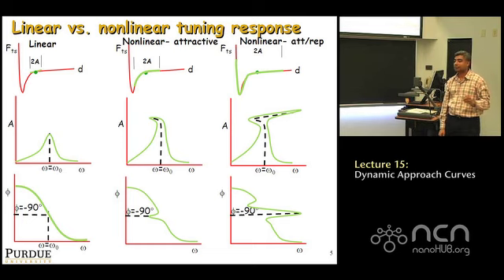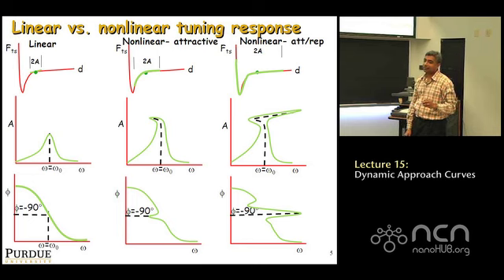Yes? Fair question to ask if anybody in the class has actually seen this behavior when they do the tuning curve. Has anybody actually seen this? Well, it's a good question, and you will see. Most tuning curves are done when you disengage from a surface. When you disengage from a surface, you're 2 microns away from a surface typically. So there's no interaction forces. So that's just to look at the response when you're in the initial faraway state.